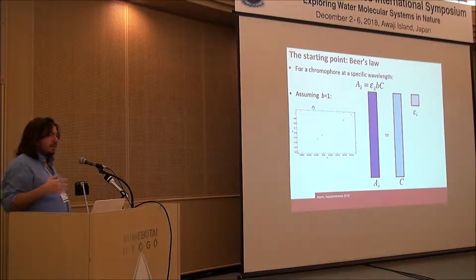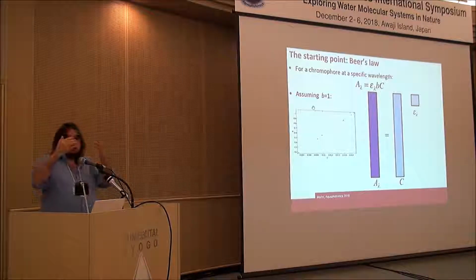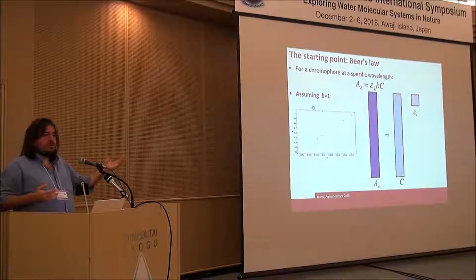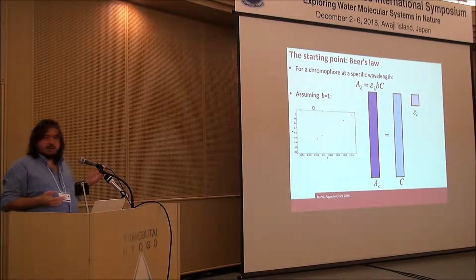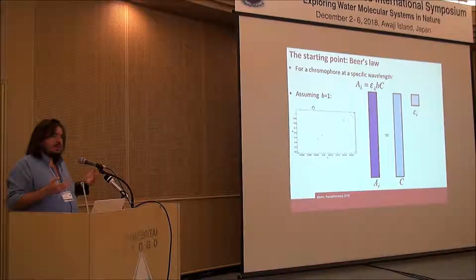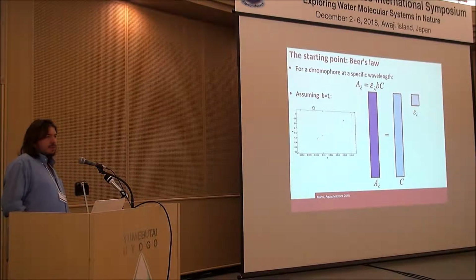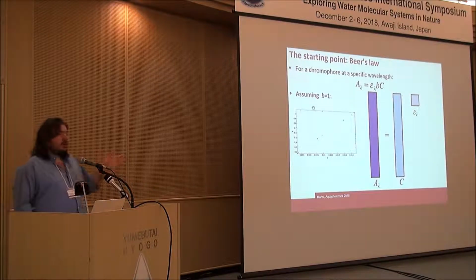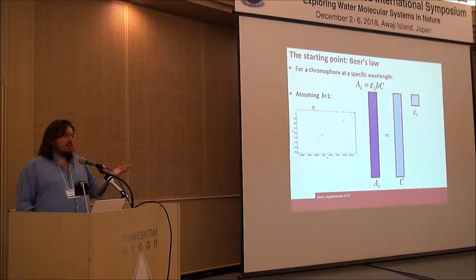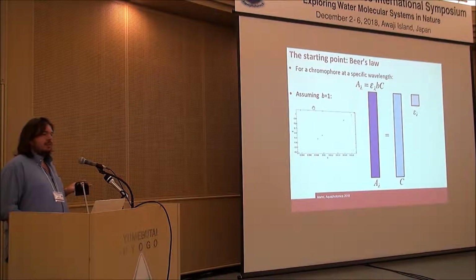And then WMAX as well. Of course, once you define these profiles, you also define the relative contribution in the different samples of these profiles, just like scores and loadings. But what is interesting about multivariate curve resolution, or curve resolution techniques in general, is that we are subjecting the data to different constraints from the mathematical standpoint.